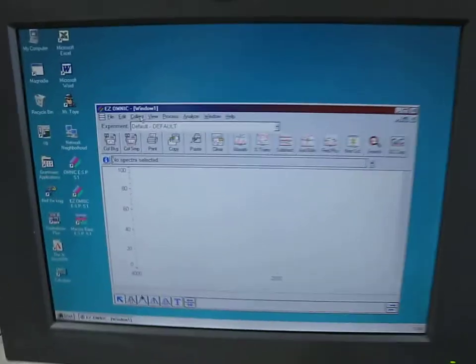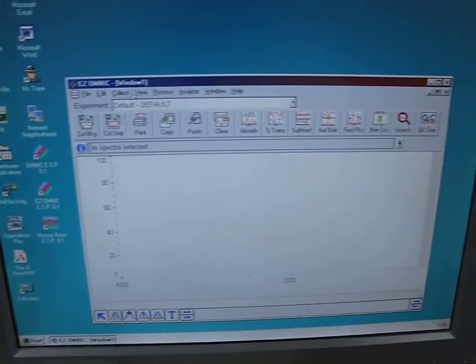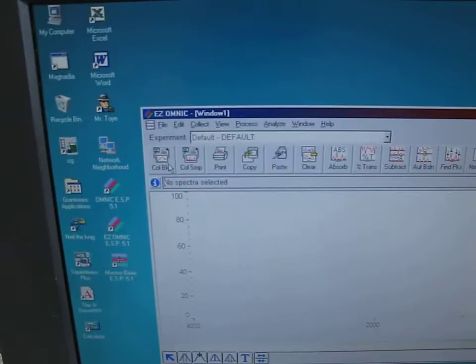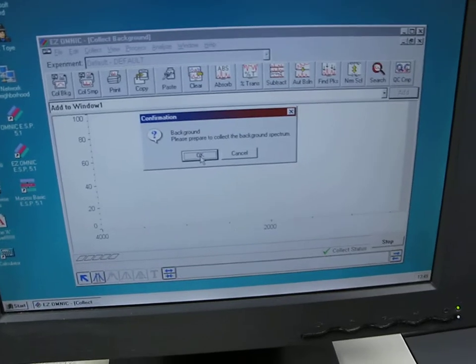What we're now going to do, this is EZ Omnic, we're now going to do a background scan so we can do that now.